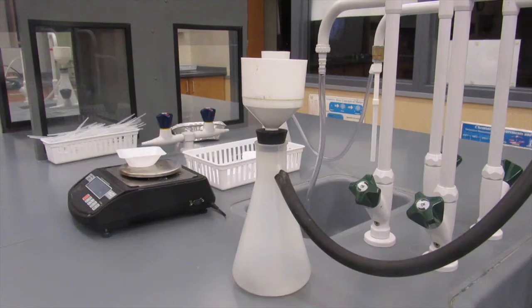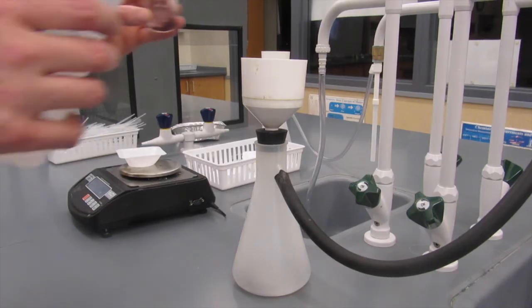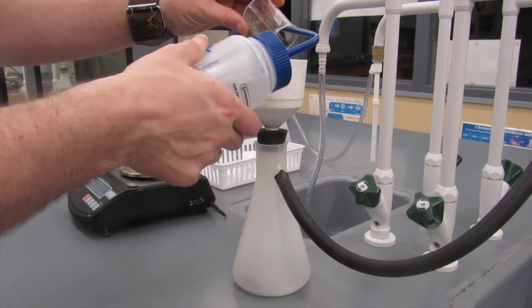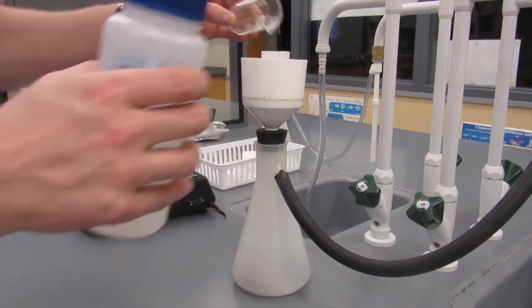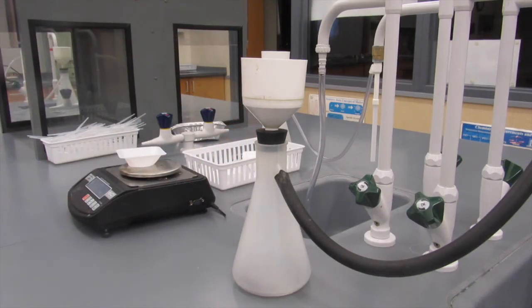Our copper solution is then dumped into the Buechner funnel, which is on top of the filter flask, and then rinsed briefly with water to get all of the copper that's off the sides of the beaker.